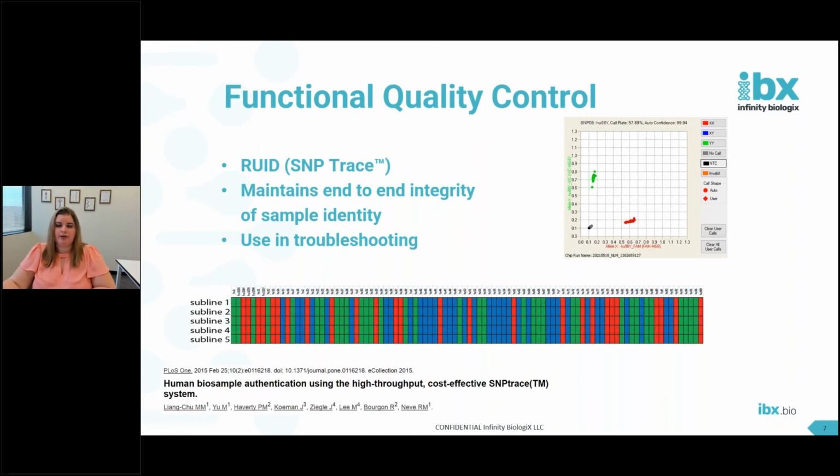We do this by comparing the genotype gender against the site-reported gender. This can identify and often rectify sample swaps that happen before we even receive source samples. The panel can also be used to identify sample swaps within a family. For example, if the identity of the proband is switched with one of the parents at the collection site.